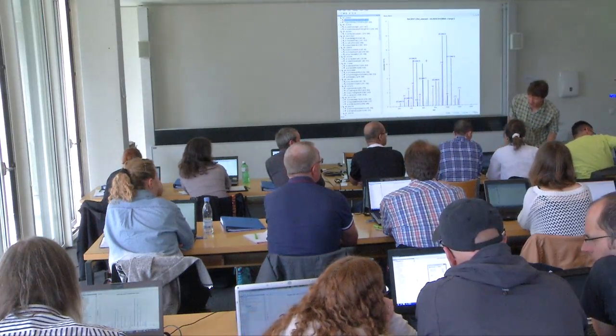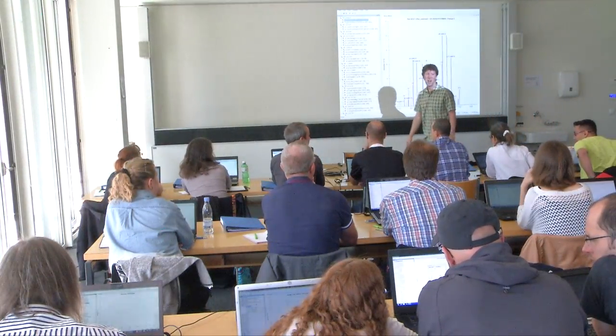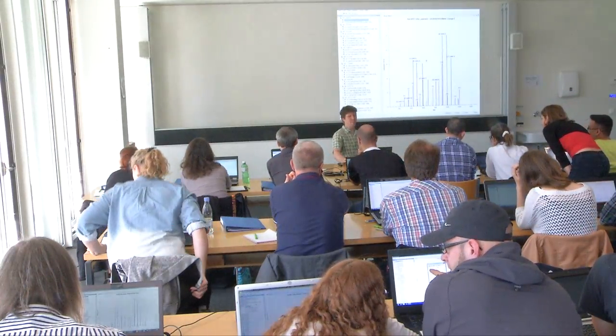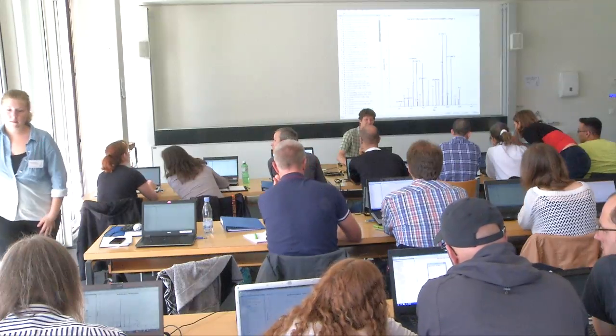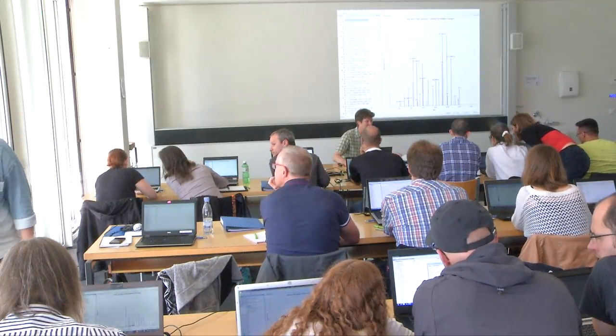You opened what I said not to open. But that's okay. Just go file open again, and if you get to the right place, you'll be all set. And Tina will help you. So she just opened the fully processed data file, which we're all going to be opening together later. It's not a problem. She can come back to it.